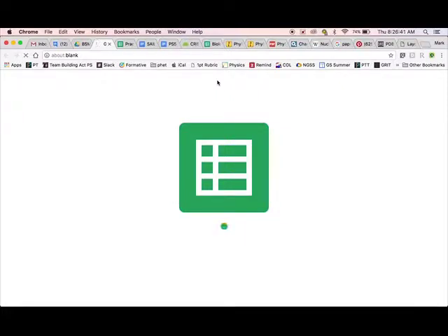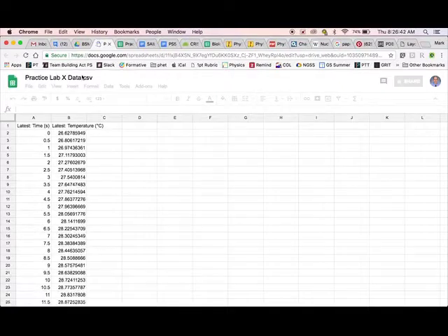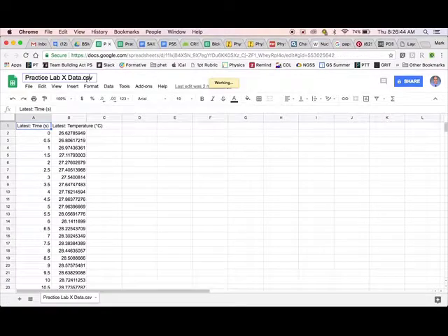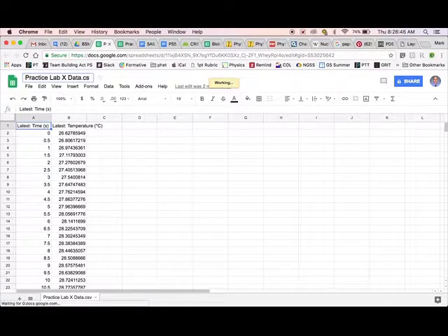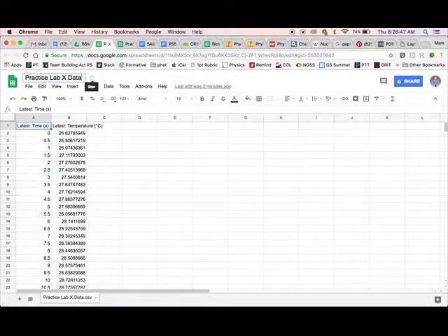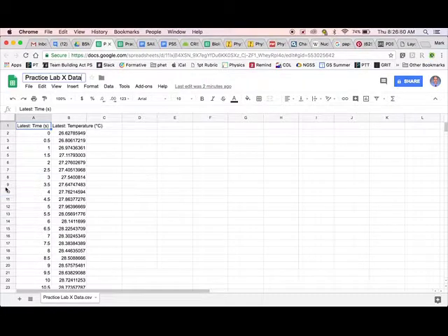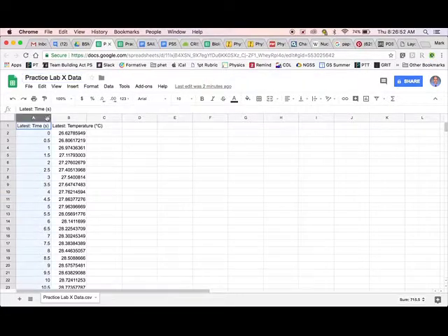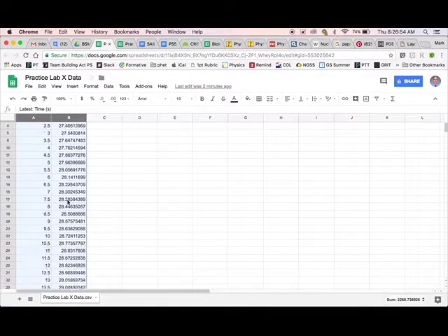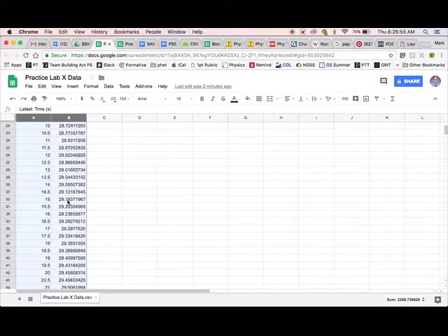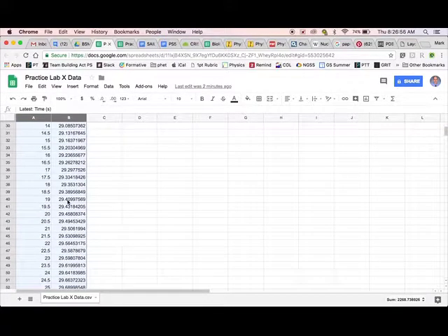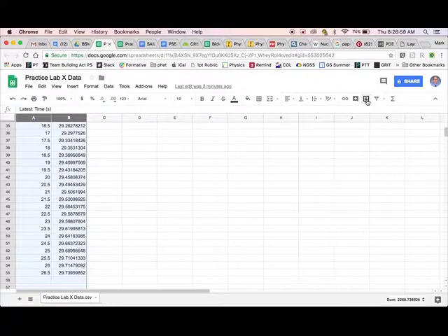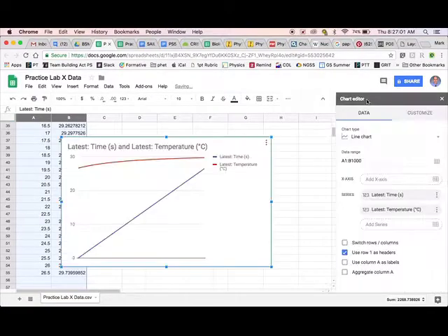Now we've got a column of stuff there. Let's name it something pretty, something that has—let's get rid of that CSV. We don't need that anymore. So we're eventually going to build a chart. Highlight both columns and go back to the chart maker. By highlighting both of them, it gets all the data. You're going to have more data points than that.